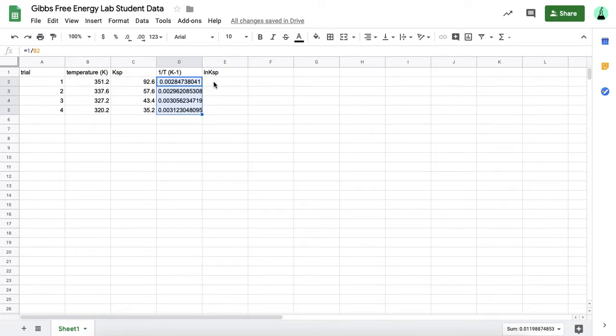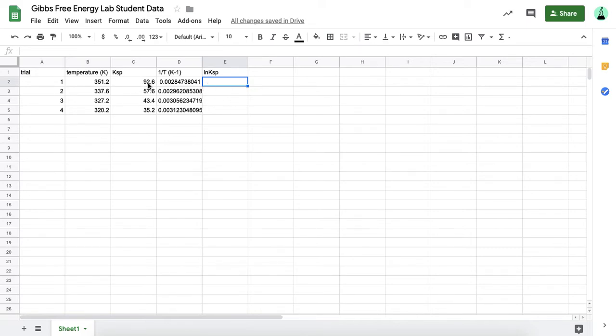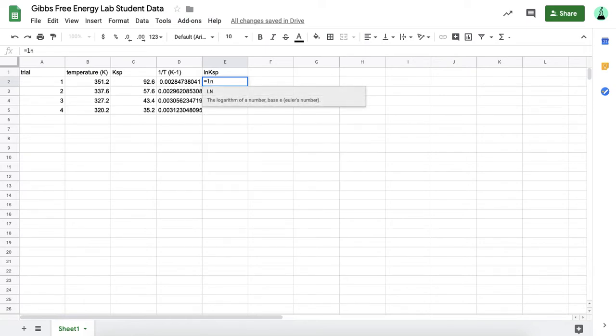I'm going to do a similar thing to get the natural log of the solubility product constant. Again, I want to convert this number into the natural log of that number. For this cell here, I'm going to hit equals, and then the formula is natural log or ln, and then parentheses to say what you want to take the natural log of.